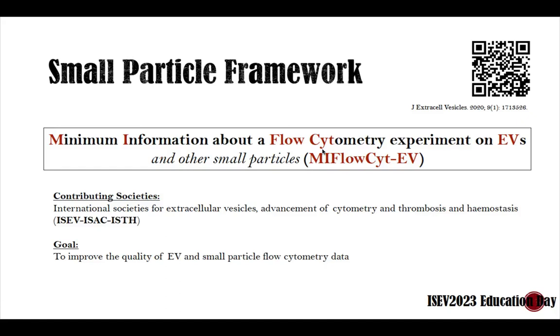So ISEV, along with ISAC, which I'm a member of, and ISTH, they came together, sat in a room in a meeting many years ago, much like this one, and decided that they needed to put together a framework to help everybody have the proper controls and sort of guidance on how to do this on flow cytometers. Because right now, flow cytometers, awesome for cells, but we need more guidance and controls for our EV work.